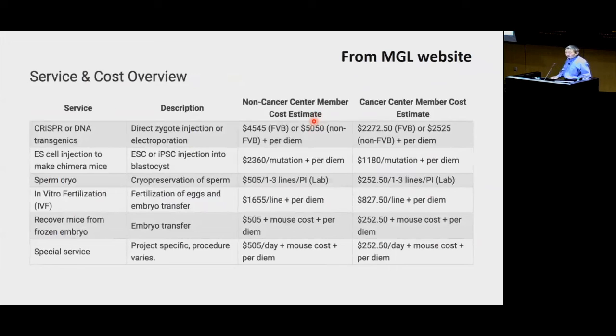They talk about their experience, and that's basically the consensus of this community. They say, for the smaller template like 1 kb or maybe 2 kb or less, go to long single-strand DNA as a template. We can do the injection, and when the template is smaller, let's say 500 base pair, 200 base pair, we can actually just do the electroporation. Electroporation worked, and we also tried at MGL. It worked well.